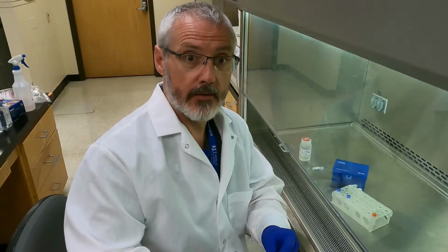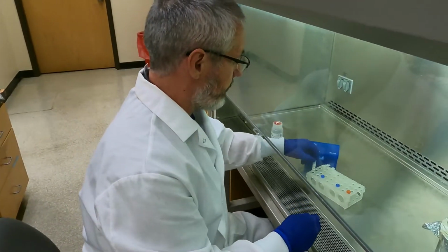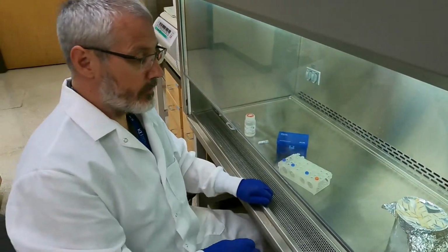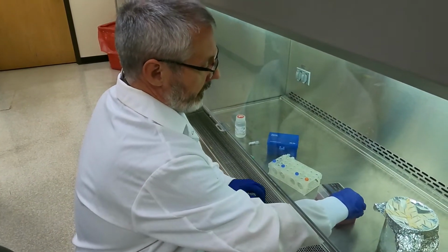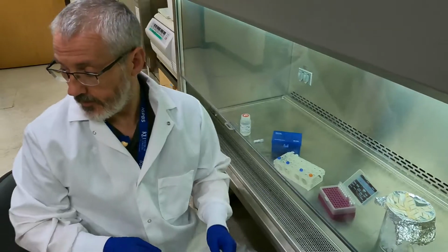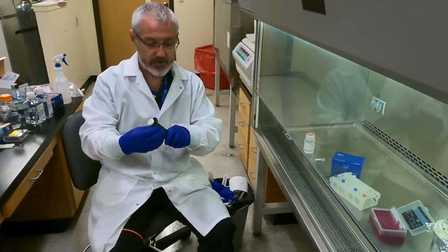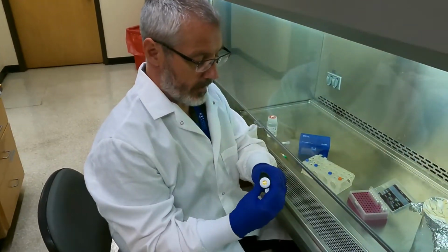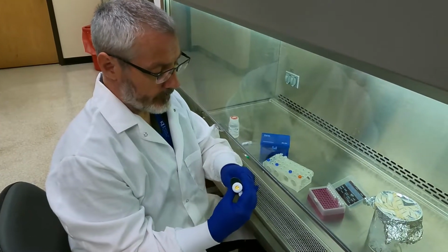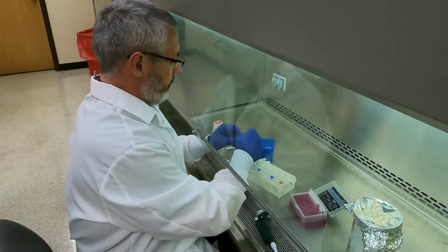So first we've got to make up the Cas12a CRISPRs, and so I've got 2, one for a protein called CU62, another one for a protein called C16, and we need to bring them up to 75 micromolar. And so to do that, we've got to take up the 2 nanomoles that we've got here in 26.6 microliters of TE buffer. In fact, this is IDTE buffer. 26.6. Right.